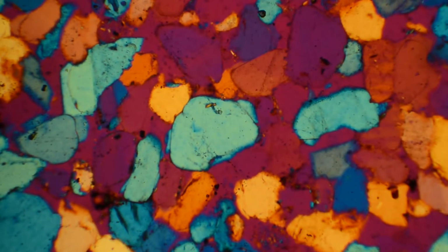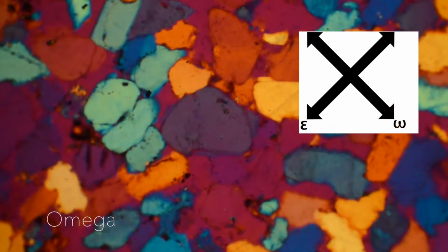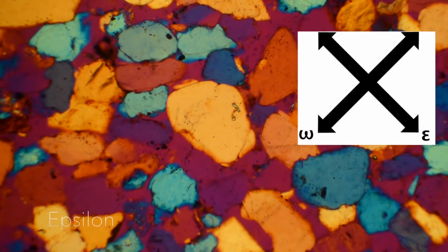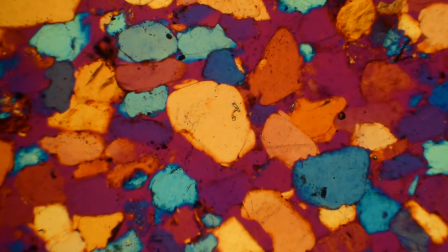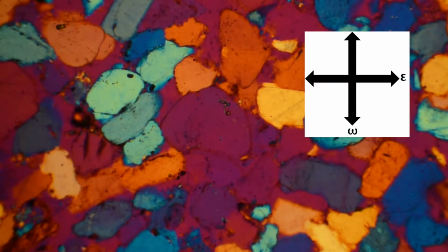I figured out previously that this mineral is optically positive, which means that I am looking at omega in this direction and epsilon in this direction. Notice the orientation of epsilon and omega in an extinction position.